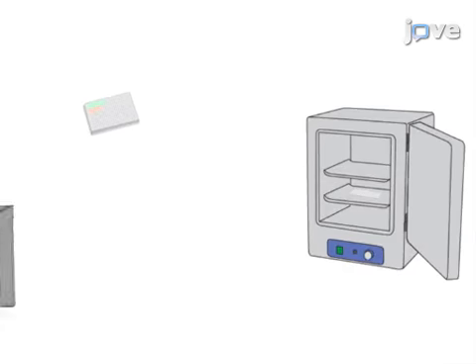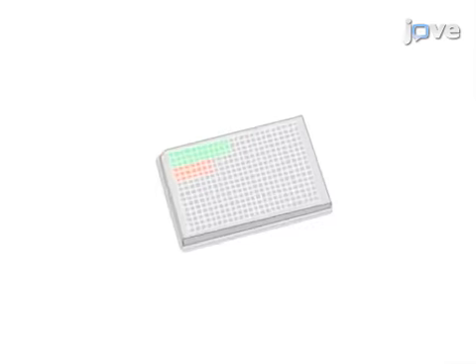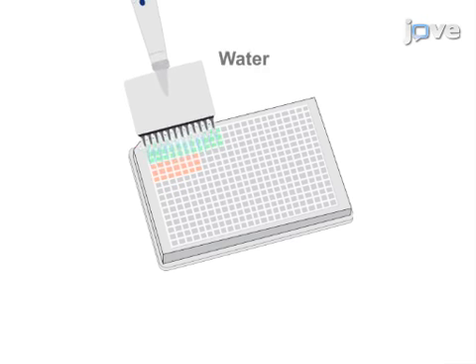The protein is incubated either at room temperature or 37 degrees Celsius to allow for the conversion of the arginine derivative into the citrulline product, which results in a covalent modification of the substrate. Next, trypsin is added to the solution in order to generate the fluorescence signal difference.